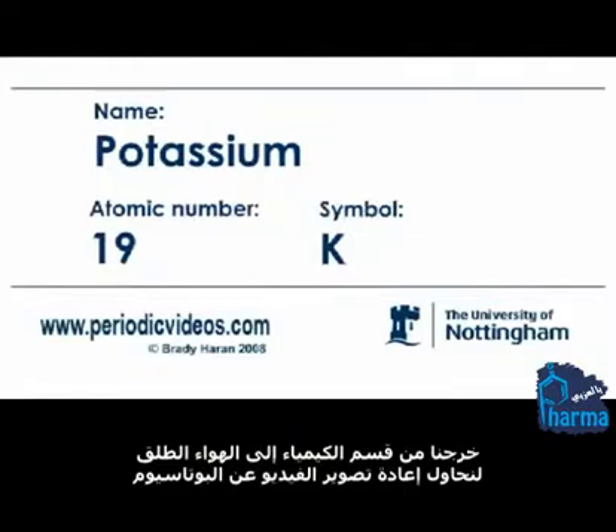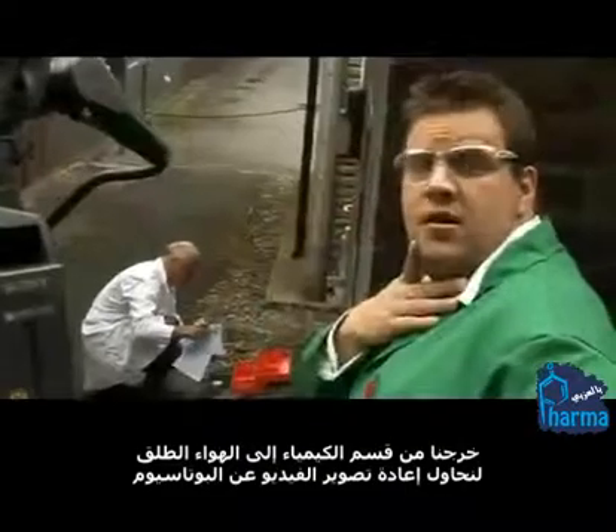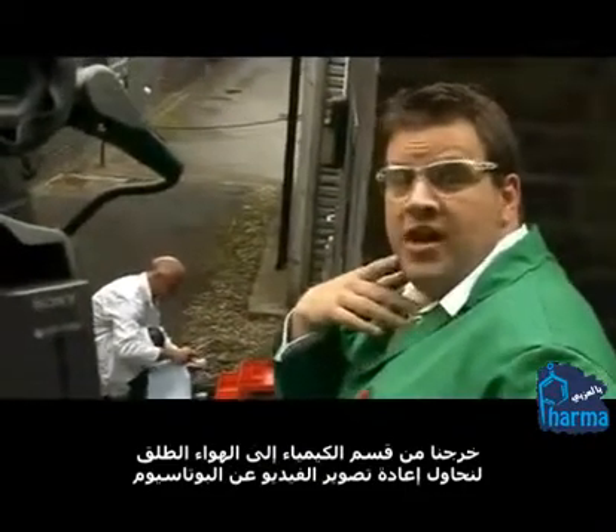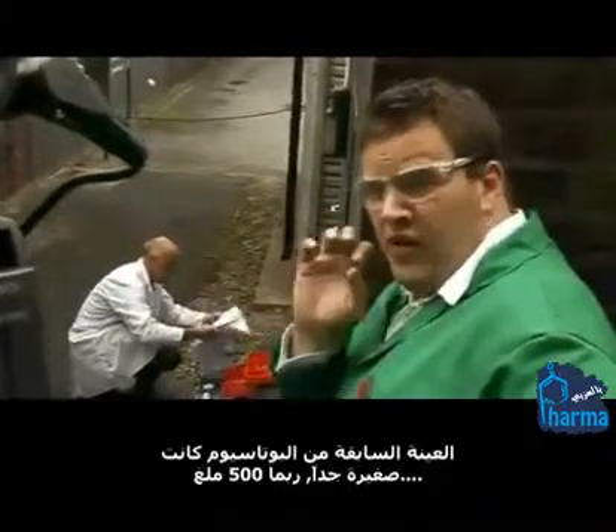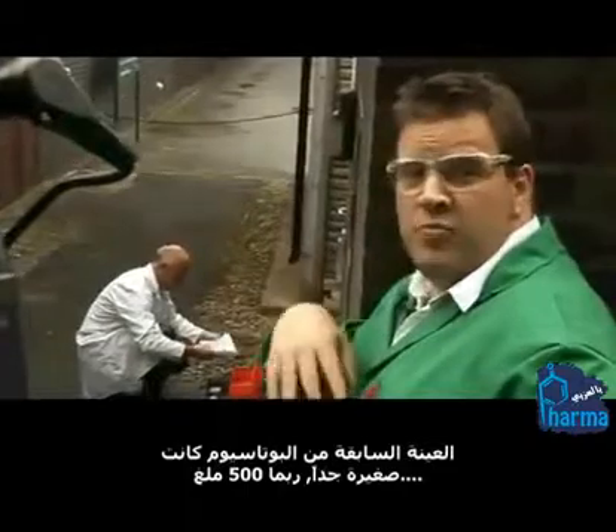We've come out behind the chemistry department in the open air to try and do a retake of the potassium video. The last sample of potassium was very very small, maybe 500 milligrams.